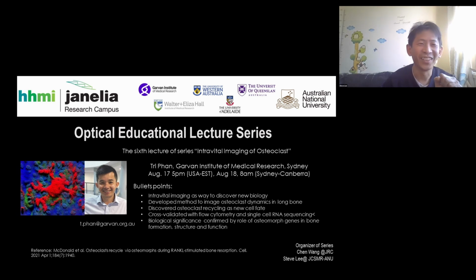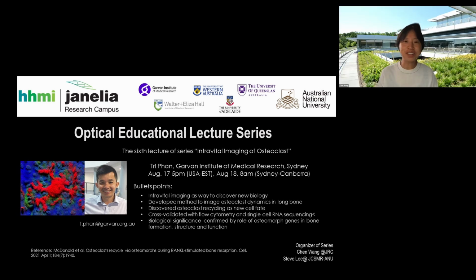So I'm interested. First, thank you for the inspiring talk. As people from the engineering field, it sounds like we have a lot of work we can do, some contribution we can make. So I'm curious, what type of objective did you use for the imaging? The reason I ask is that normally we use a water dipping objective, but for bone imaging, as you mentioned, the refractive index is quite high, so the water dipping objective may not be suitable for you.